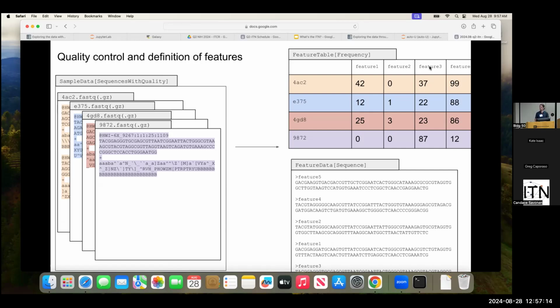We'll think of a sequencing artifact as some bias that was introduced into the system. If you look up the definition of artifact in the dictionary, you'll see there are these two different meanings. We're using it in the sense of an archaeological artifact, not exactly, but in that sort of use of the term. Basically meaning it's something that was created, a result of some process that was run.